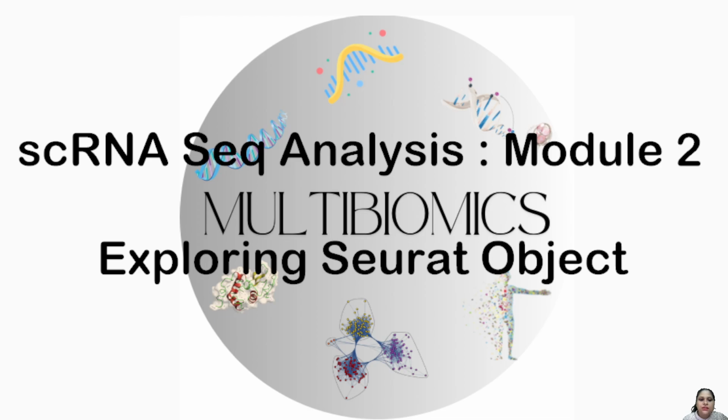But before that, if you have gone through the last video of the first module, we were going on with the clustering and annotation of the PBMC single cell dataset. You would remember that in the last part of the script, we saved the Seurat object with the help of the saveRDS function. And we named it pbmc_3k_final.rds. So it's an R object.